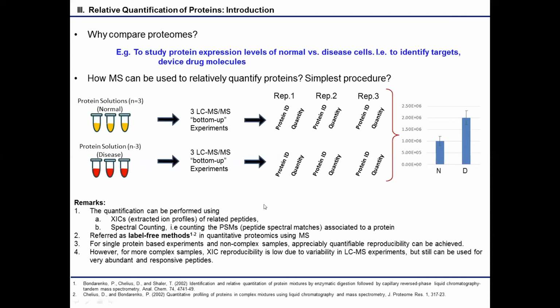I think Amber would explain this better than I would, but I'll try my best. In a Western blot procedure, you analyze only one protein. It's like a targeted mass spectrometry approach. You are targeting one protein only. But when you do bottom-up proteomics experiments, you get thousands of proteins identified and quantified. So it is something like doing thousands of Western blots all together in one particular experimental procedure. If that answers it. Yeah, that's a great answer, Aruna.